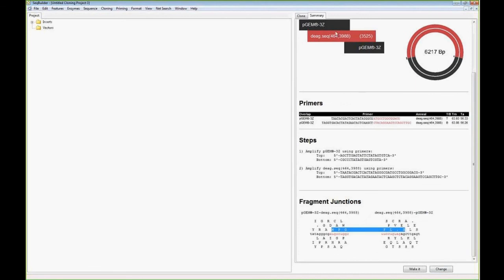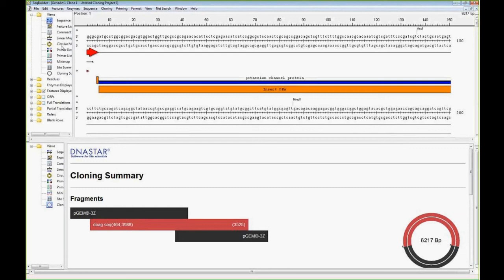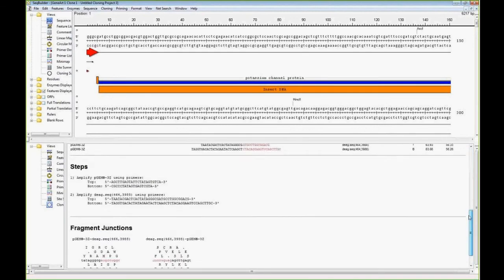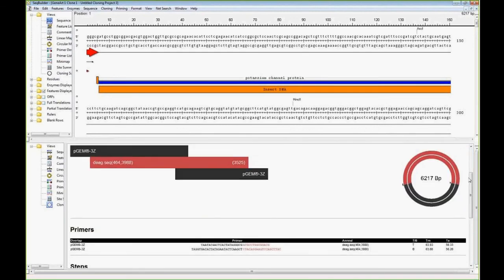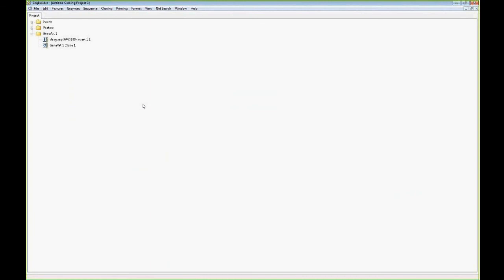In this specific case, I'm just doing one protein, one target. But whether you want to do one target, 2 targets, 6 targets, entirely up to you. I'm going to make it. And then I'm going to assess the quality of my results. So what we've done here is automated the process entirely. So all the basic various technologies go through this interface. So in this interface, you simply select the cloning method, and the software, the underlying parameters, will do everything for you to add the appropriate ends.